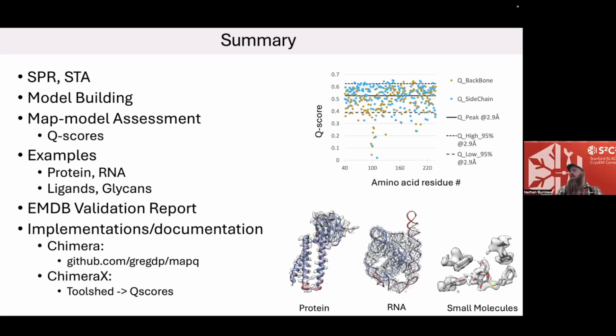Another question here is, does the PDB consider showing Q-score on structure summary pages together with clash score, Ramachandran outliers, etc.? In terms of the overview, that's something we've talked about recently, and I think it's in the works, because it would help to have an overall map quality or map-model fit along with those other model parameters. Right now, the overview only shows those three parameter categories that are model oriented. Clash score is only model oriented.